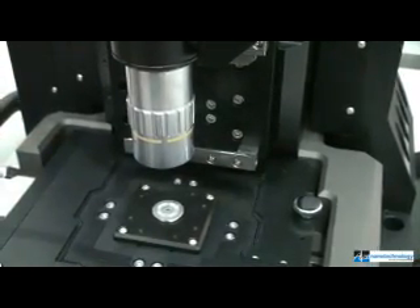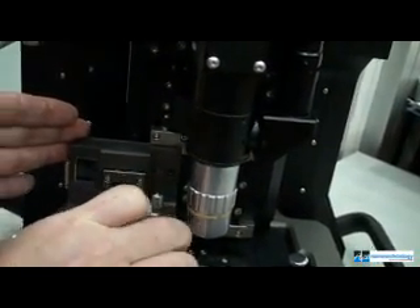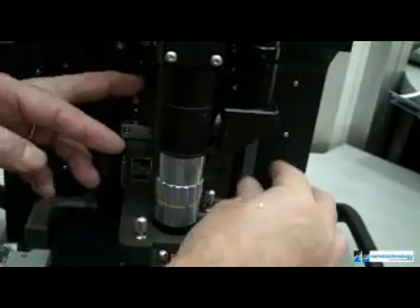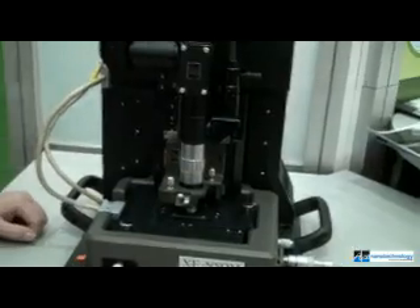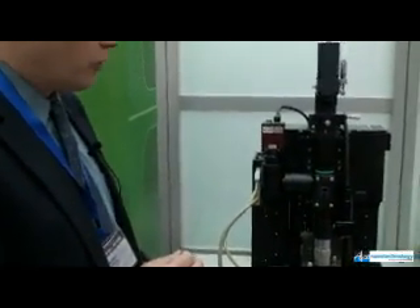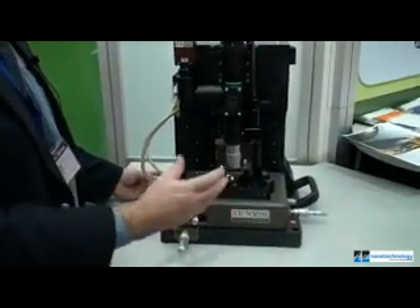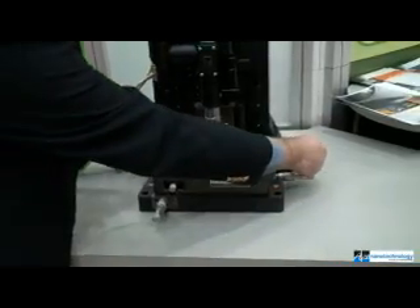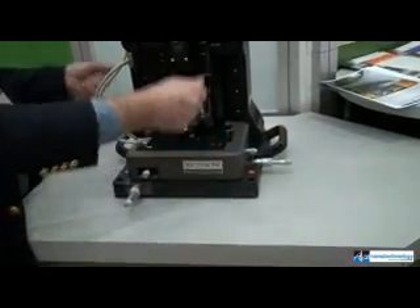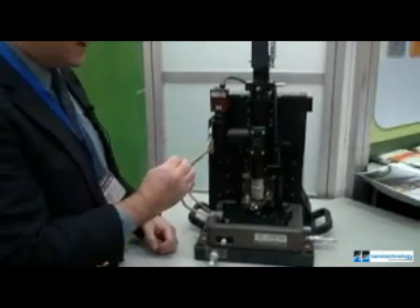The NSOM technology is equipped for either transmission mode experiments, where you have a transparent sample, or reflection mode, where you're investigating the optical properties of a non-transparent sample using reflected light. For a transmission-type XE-NSOM experiment, a detection box with optical components and lenses for collecting transmitted light sits beneath the NSOM stage, which has handles so it can be lifted and placed on top of the detection box.